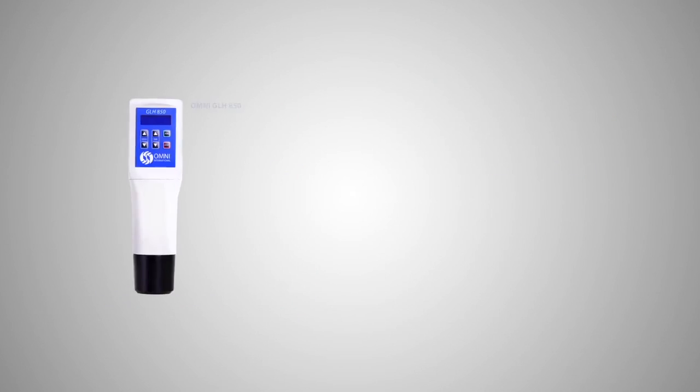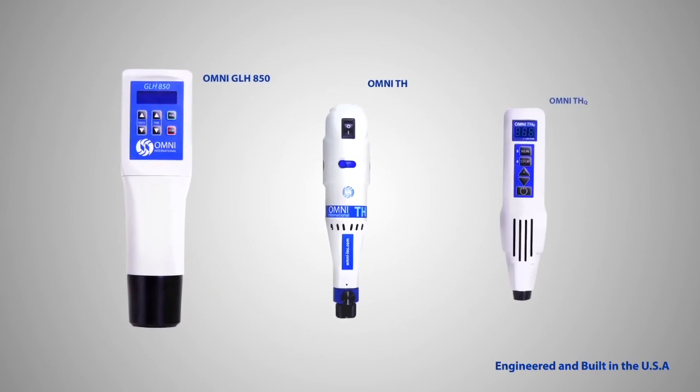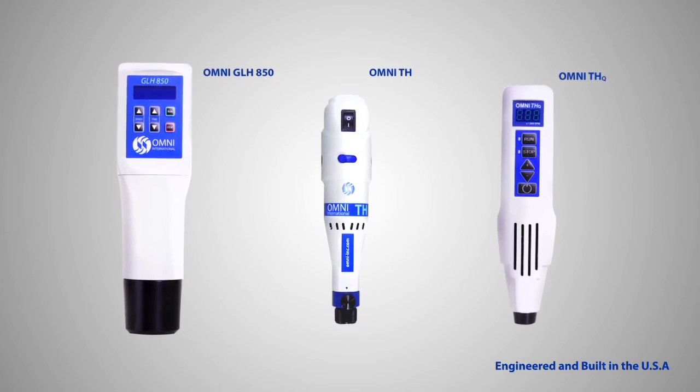The Omni Rotor Stator Homogenizers, engineered and built in the United States to ensure ultimate reliability.